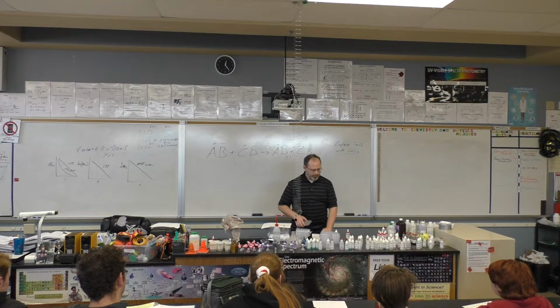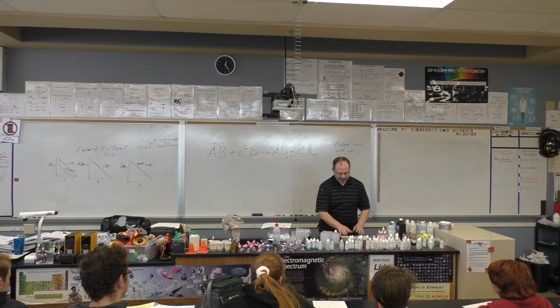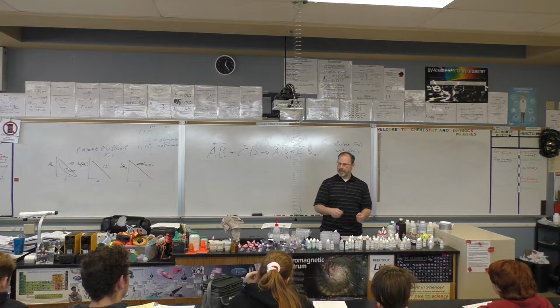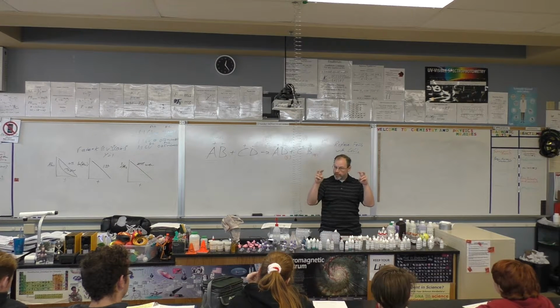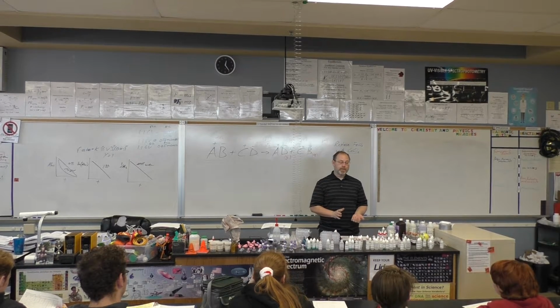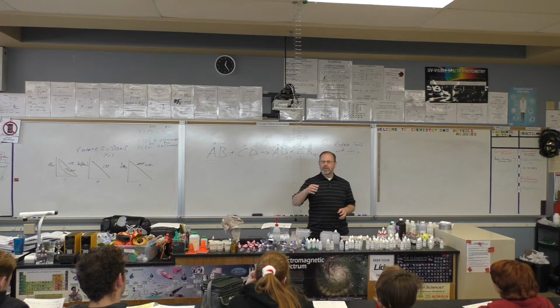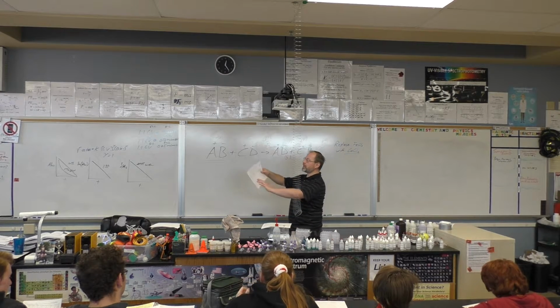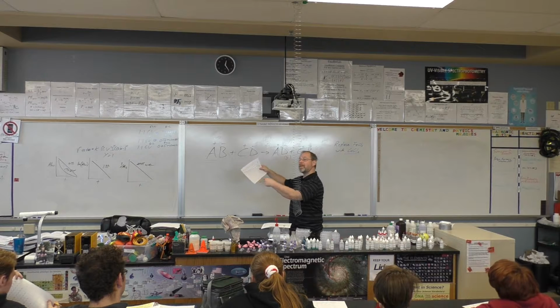So your spot plate is going to be on your desk like this, which is black. Get a piece of paper and go black, white, black. Yeah, it did change something. It used to be this color, now it's this color. It used to be clear, now it's cloudy. Make sense? So if it changed, it became cloudy, a precipitate has formed. Some of them are going to be really significant. You're like, whoa, it turned brown. And some will just be, it was pink, now it's pinkish cloudy. Make sense? All right, so if a precipitate forms in that combination, you're going to write yes.